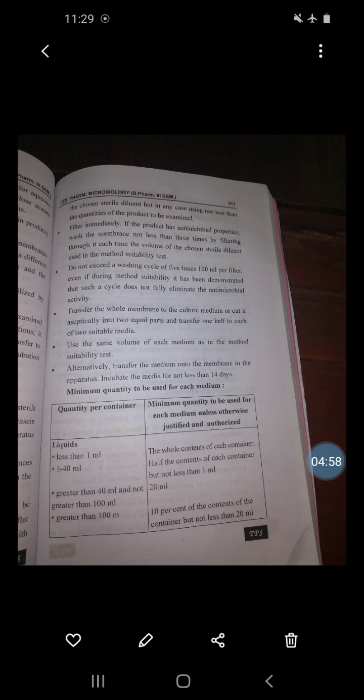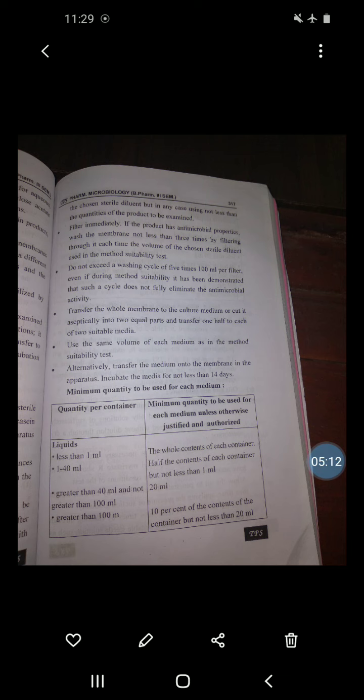Then transfer the whole membrane to the culture media, or cut it aseptically into 2 equal parts and transfer one half to each of two suitable media. Use the same volume for each medium as in the method suitability test. Alternatively, transfer the medium onto the membrane in the apparatus and incubate the media for not less than 14 days.